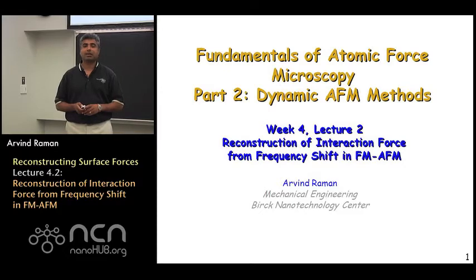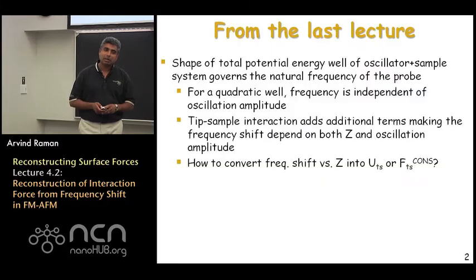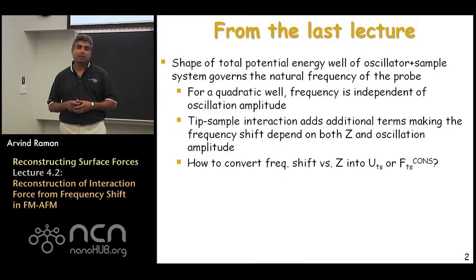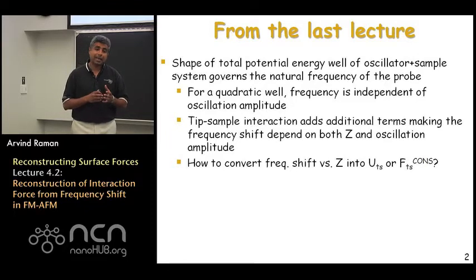The last week we were talking about frequency modulated atomic force microscopy, but more specifically from the point of view of trying to understand the connection between the frequency shifts, which will be one of the observables in dynamic AFM as you approach the sample in frequency modulated AFM, and the total potential energy landscape, which is the sum of the potential energy due to the tip-sample interaction forces and the quadratic well corresponding to the elastic spring of the cantilever.